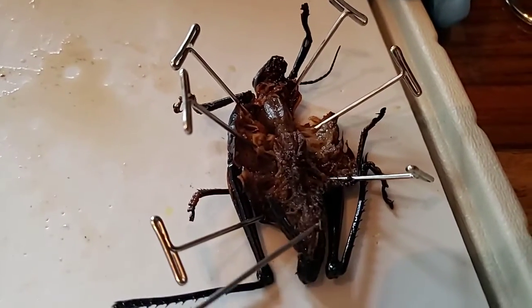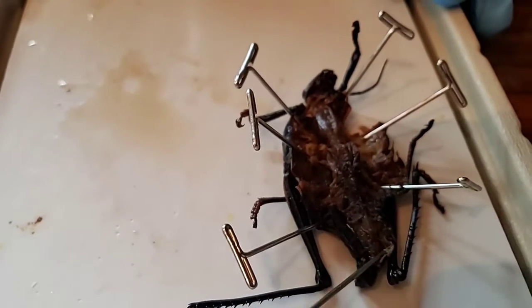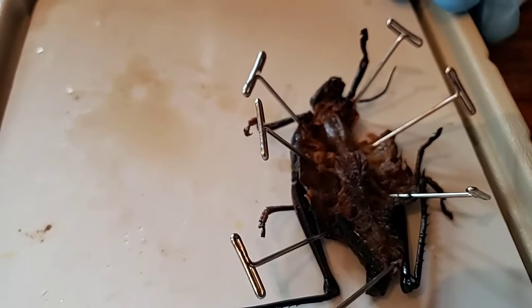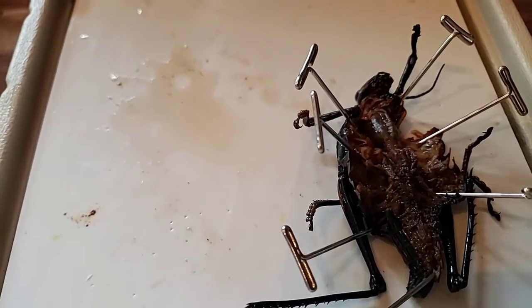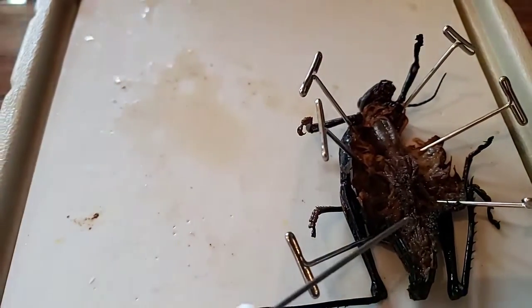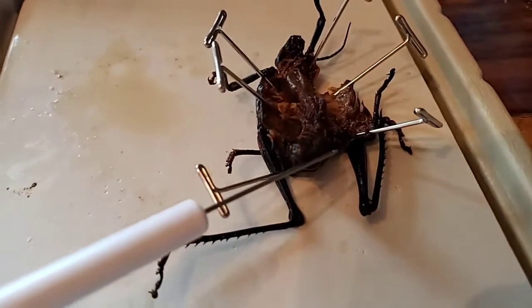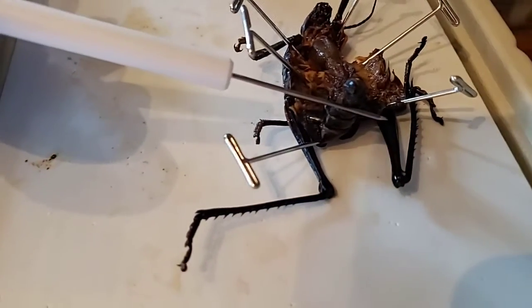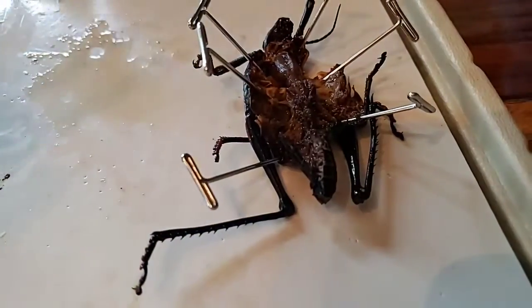So Tanley is opening up her abdomen. In a female, the ovary appears as a series of tubules containing rod-like eggs. Females also have ovipositors, four curved projections at the end of the abdomen. So Tanley, look at the end of your abdomen. Do you have four curved projections? Lanston, look at the end of yours. Do you have four? Tanley's has four. So Tanley's is a female grasshopper.